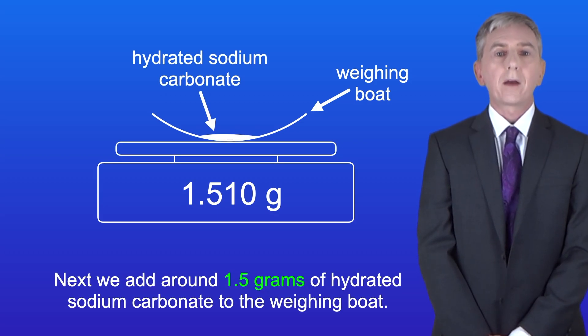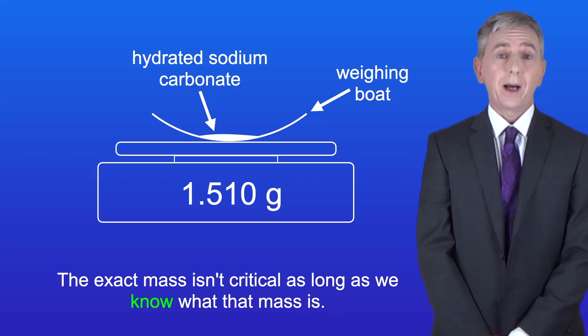Next, we add around 1.5 grams of hydrated sodium carbonate to the weighing boat. Now the exact mass isn't critical, as long as we know what that mass is.